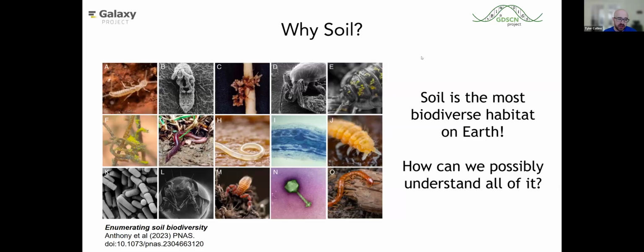All right, so to begin with, we're going to be working with soil data today, and you might ask, why look at soil metagenomic data as compared to the human gut or ocean water or anything else? I think one of the main answers is soil is one of the most biodiverse habitats on Earth. There was a recent paper from 2023 making an argument that huge amounts of the diversity in life is actually present in soil more so than any other environment. In addition, a lot of the microbes in soil are unculturable in a lab, and so it's notoriously understudied. I forget the top number off the top of my head, but I believe over 90% are unculturable. And so there's so much unknown, and it's a super interesting place to look at and make some new insights and discoveries.